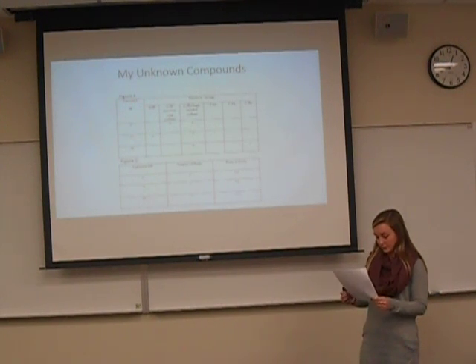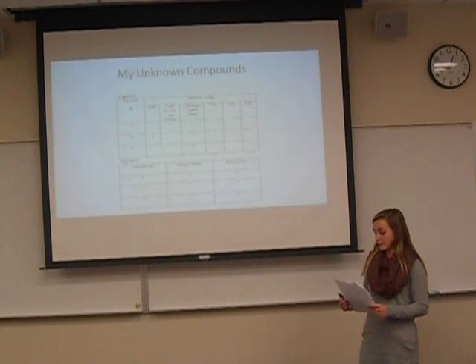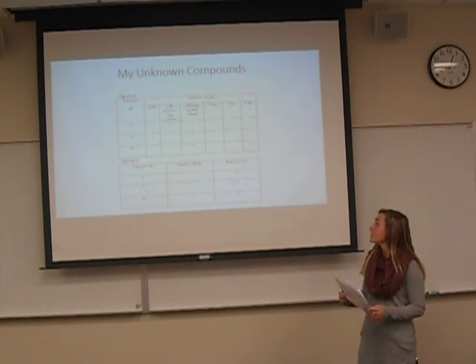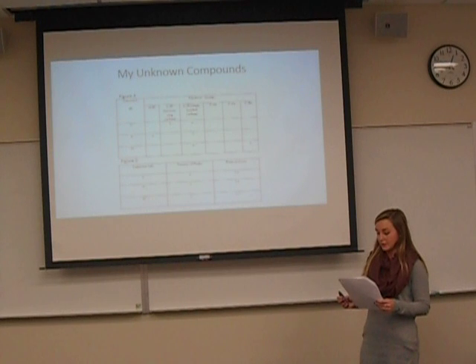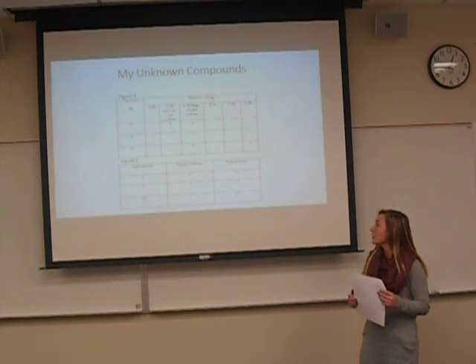I was given 3 unknown molecules, named F, A, and M, number 48. In figure 4, the X's indicate which functional groups were found in each IR graph. Figure 5 shows the amount of peaks found in the NMR graphs as well as the ratios of the different types of hydrogens. As you can see, molecule F has 2 peaks in the CH benzene ring and the CH singly bonded carbon regions. Molecule A has 2 peaks in the OH region and the CH singly bonded region. And molecule M has 2 peaks in the CH singly bonded region and the CBr region.